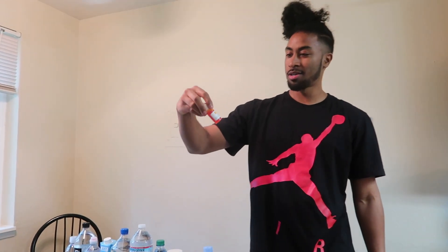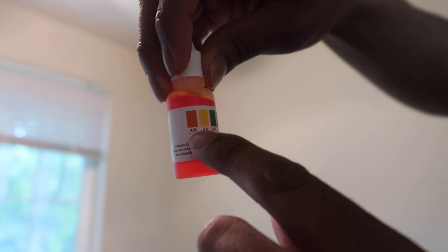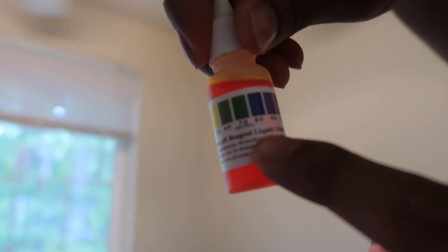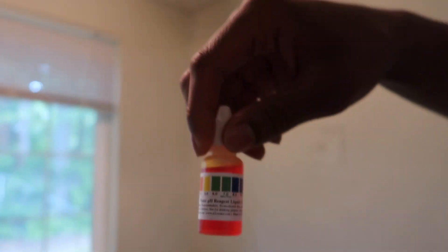We're about to do the water test — we're about to test which water is good and which water is bad for you. We got the pH tester right here. So we got the acid, which is right here, it's gonna show up orange, and then we got the alkaline which is right here — the purple — and we're gonna see which water is good or not.